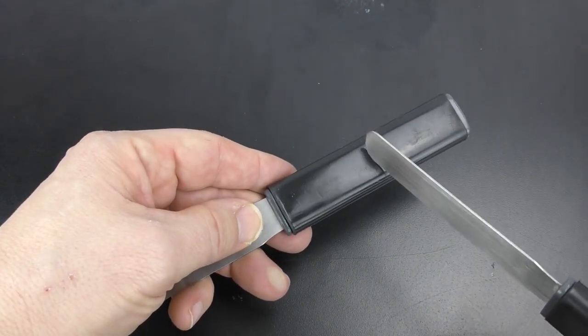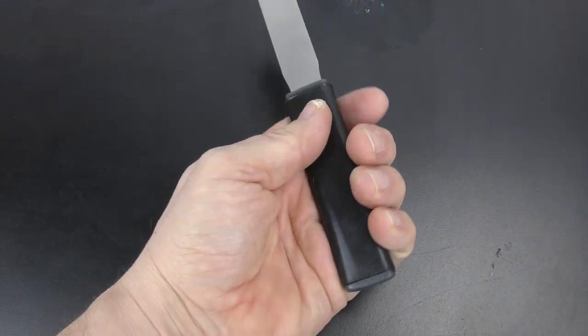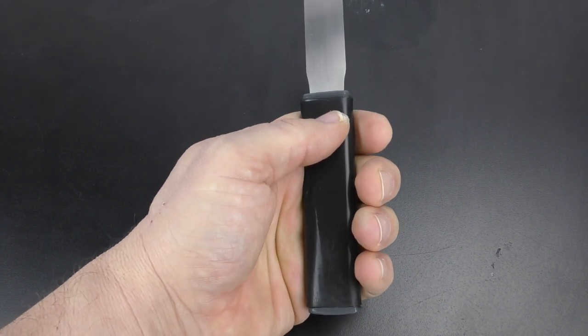but the outer sheath is made of silicone, so it's much more comfortable to hold for working in the labs for hours at a time without giving you hand fatigue.